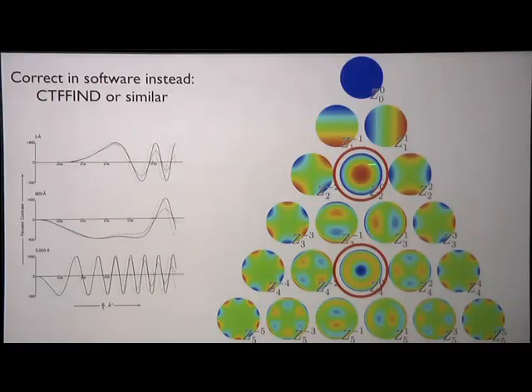Whereas defocus is exactly what we're trying to change with the current. Because of that, we can shift the phase of this relative to this and make a pseudo phase plate, right? So this is what we're using to generate the contrast in these images, the difference between these two aberration coefficients. Anyway, enough aberrations.